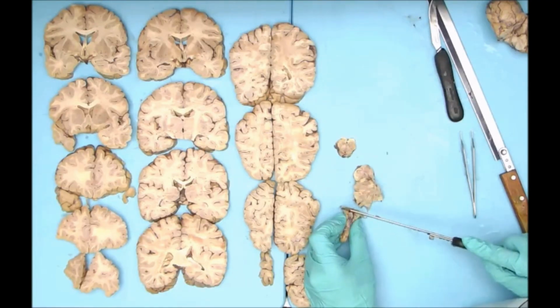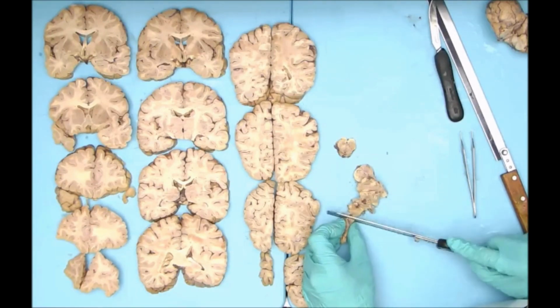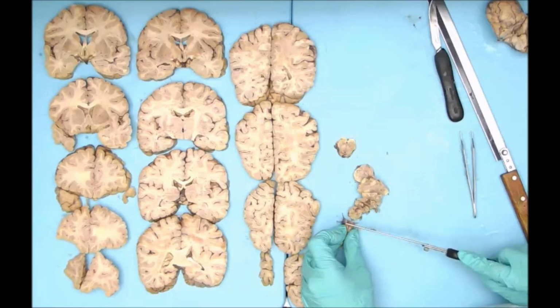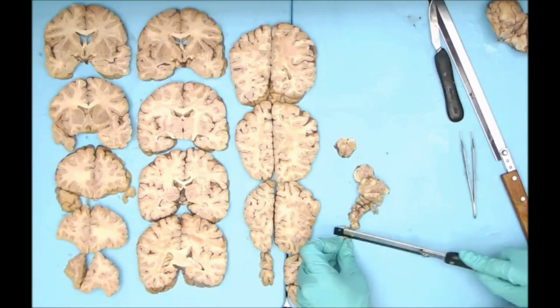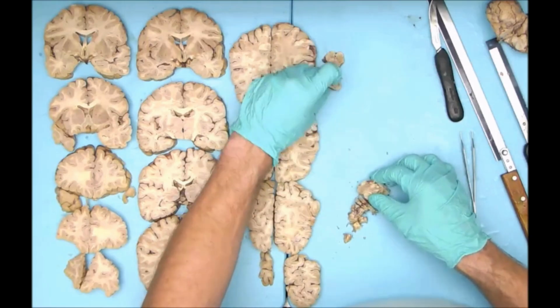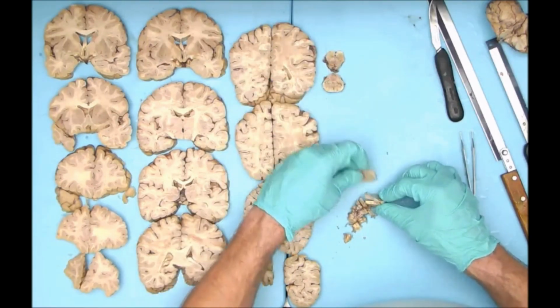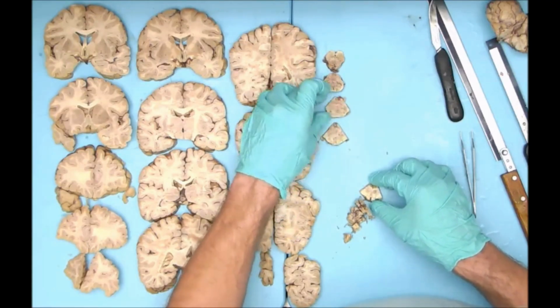So once again, I'm just sectioning through the brainstem, starting at the substantia nigra, moving down to the medulla, and then I'm going to lay these out sequentially.